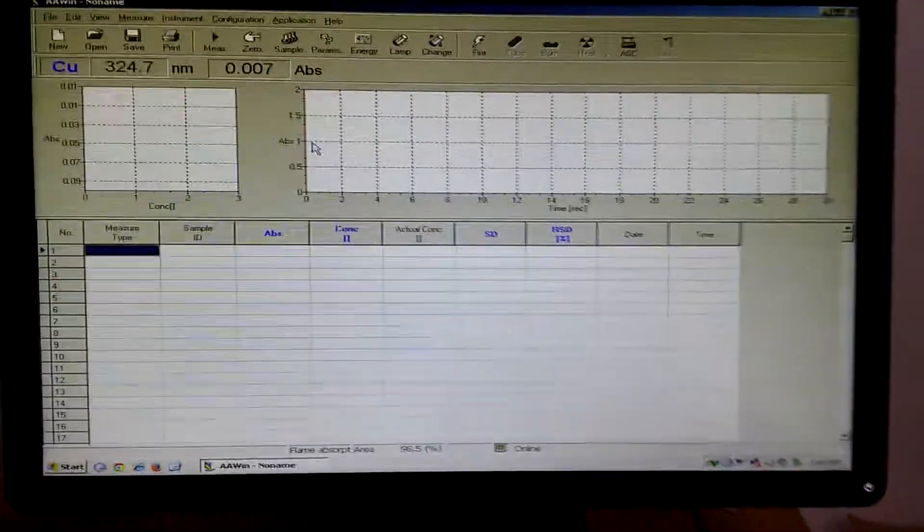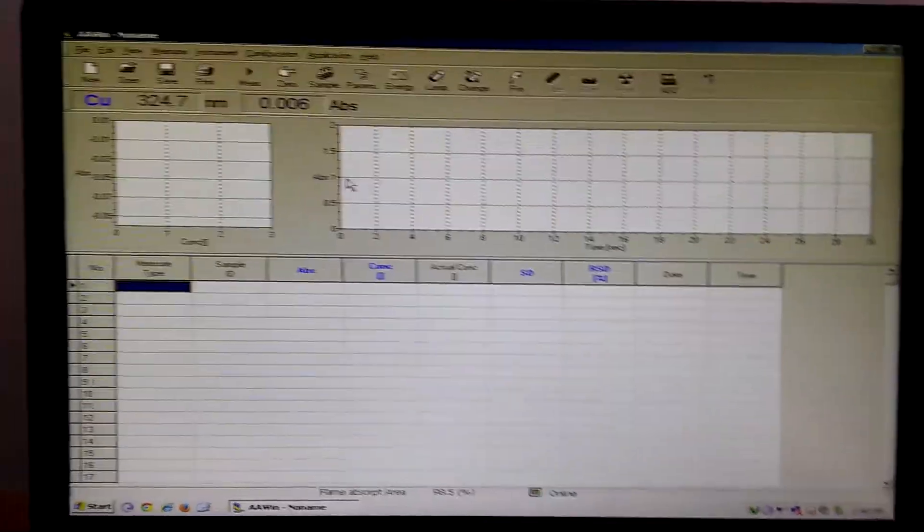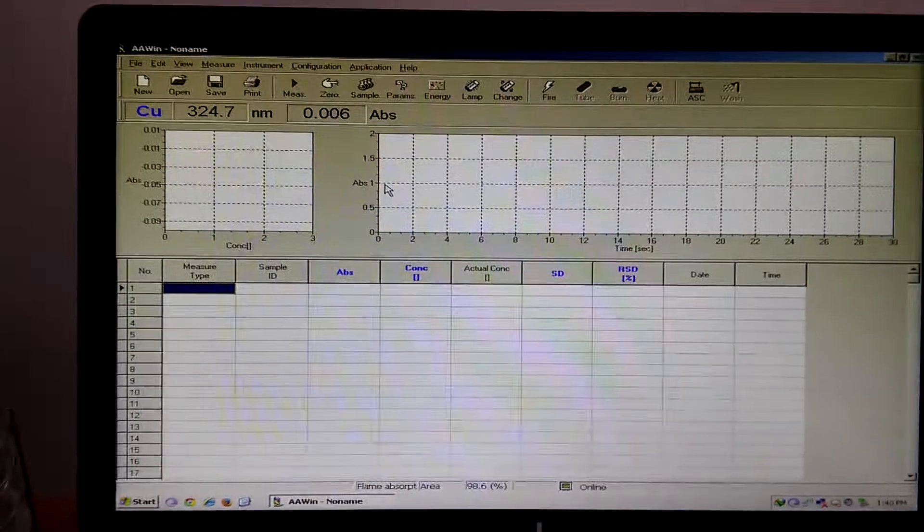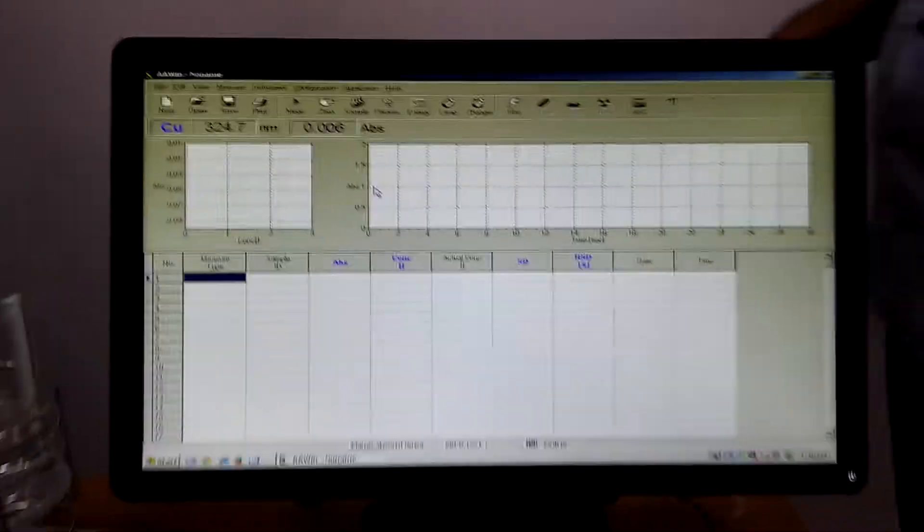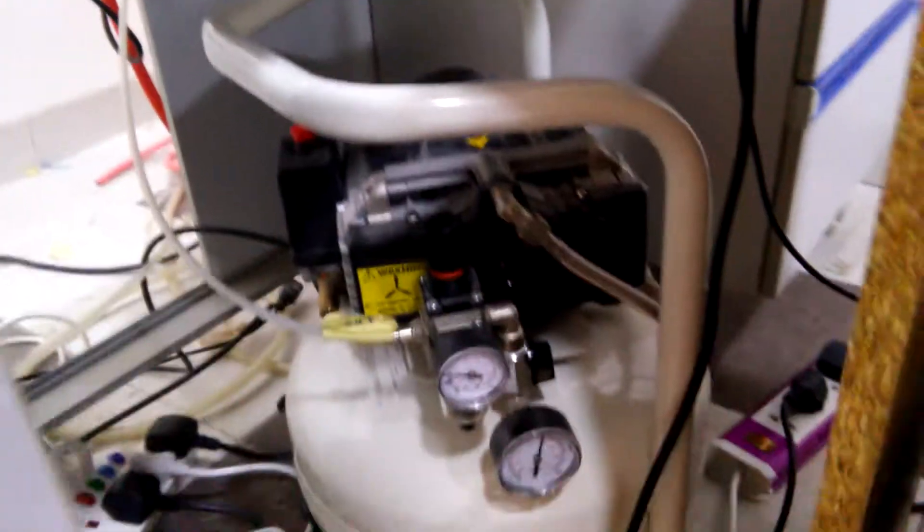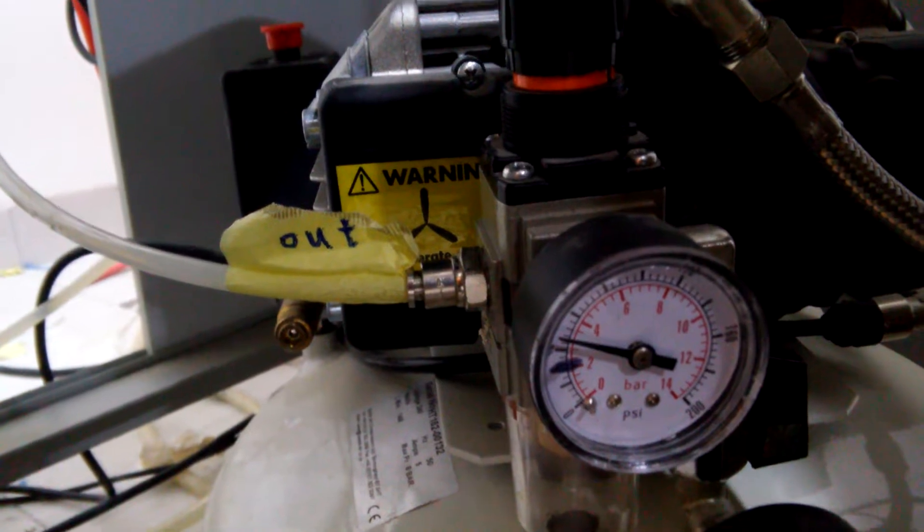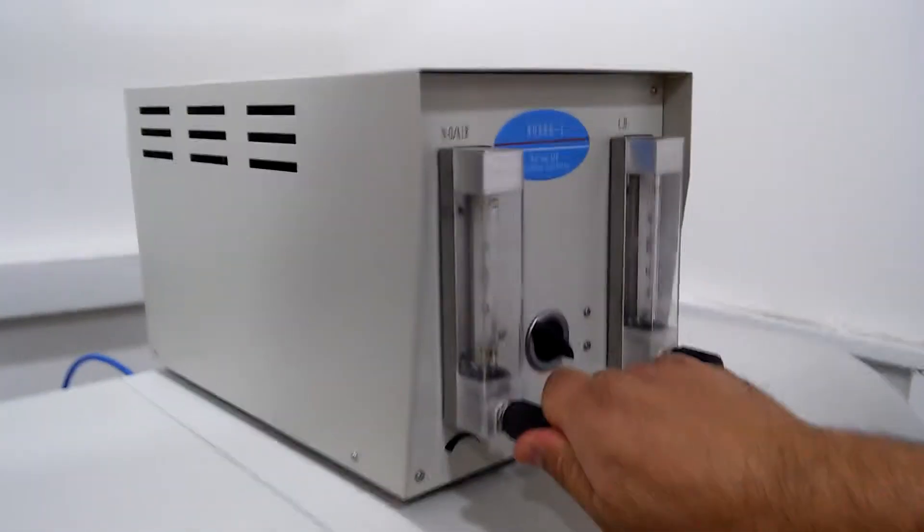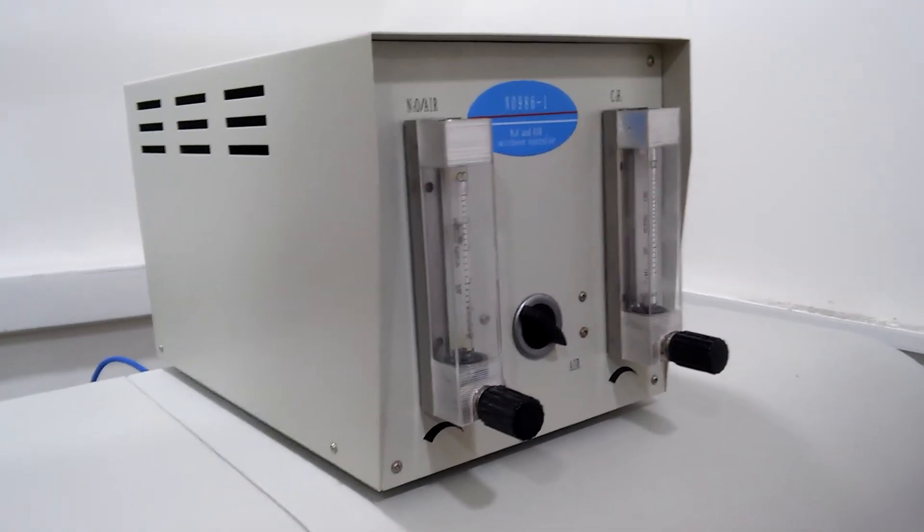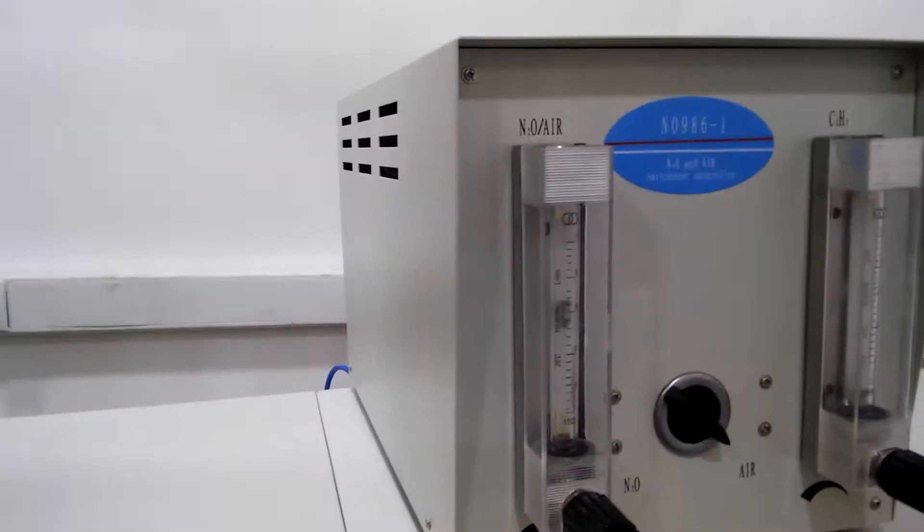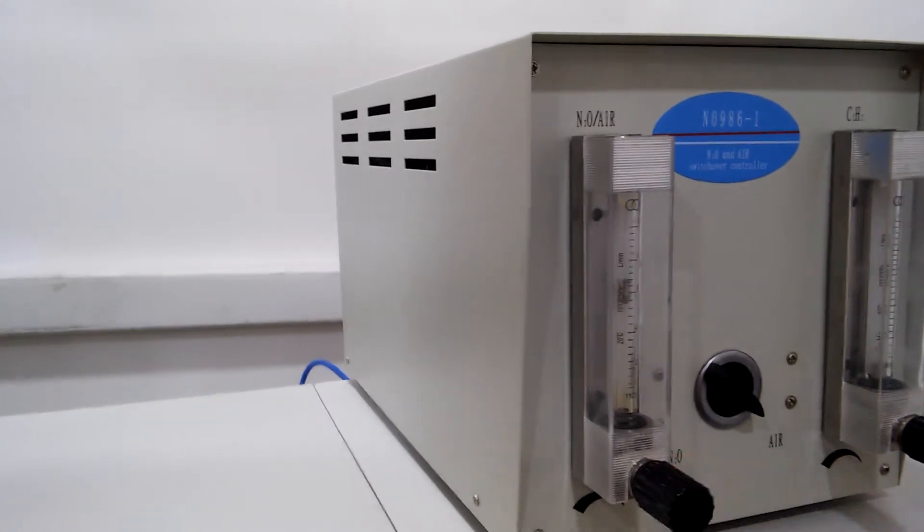Now we are going to ignite the instrument, so first of all we have to make sure of the pressures for air and acetylene. This is the air compressor and these are the gauges. This gauge has to read between 0.3 to 0.4 megapascal. From this we can control the flow rate of the air. Now this is okay, keep it. This is the burner head which is made of titanium alloy.